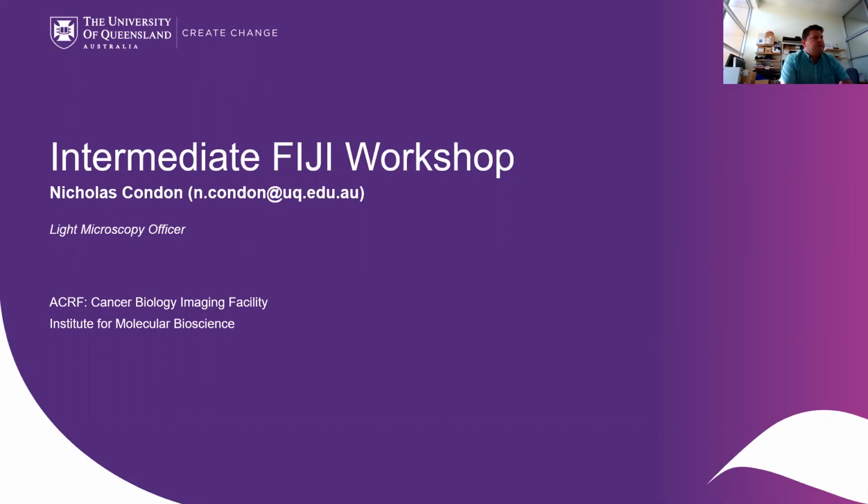But yeah, this is the intermediate Fiji workshop. So it assumes a little bit of background, that you know how to open files and do things. I'm going to go through processing and thresholding and some of the more advanced topics.